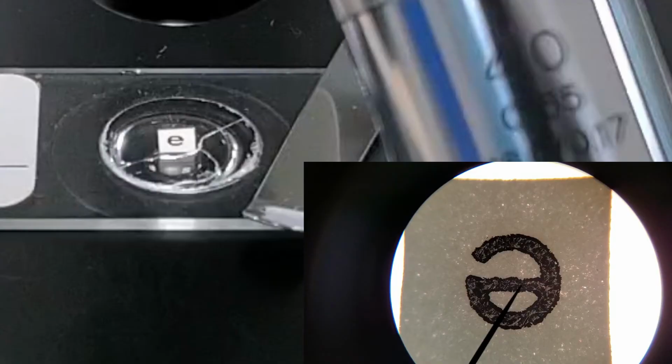The field of view is just whatever you see through the ocular lens. One thing to keep in mind when looking at your sample is that the image that you see through the eyepiece is mirrored in both the horizontal and vertical directions. This basically means that the image that you're seeing is rotated 180 degrees or upside down.